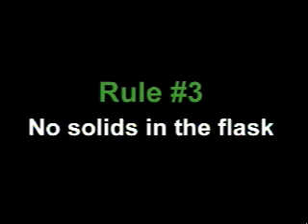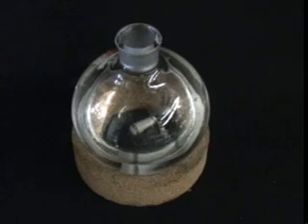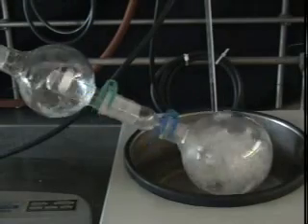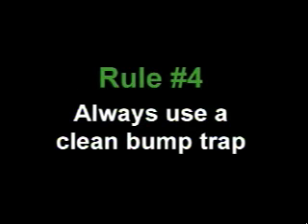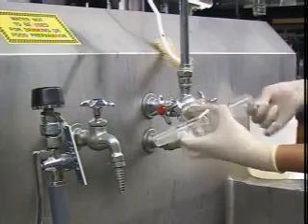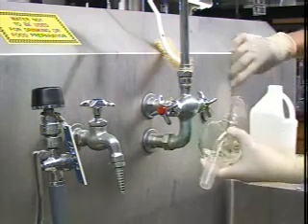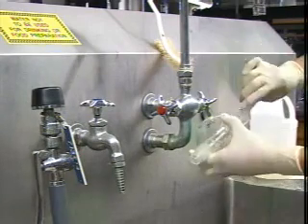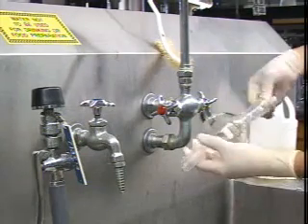Rule number three, make sure there are no solids in the flask. This includes stir bars. They may seem harmless, but they can also lead to bumping. Rule number four, always use a clean bump trap. Even when you're careful, bumping can happen. Therefore, you should always thoroughly wash the bump trap and rinse it with solvent before you use it. You never know what someone else may have left inside, and you don't want it to end up mixed with your material.